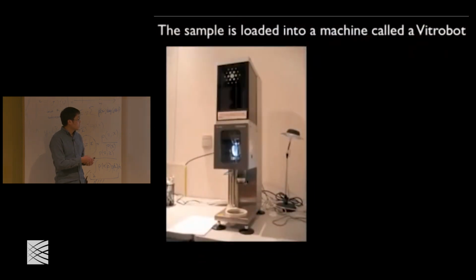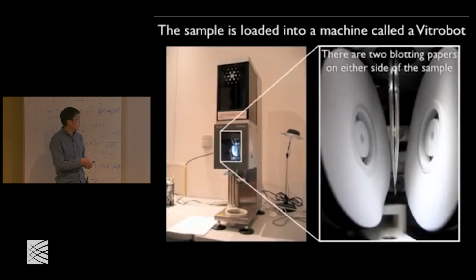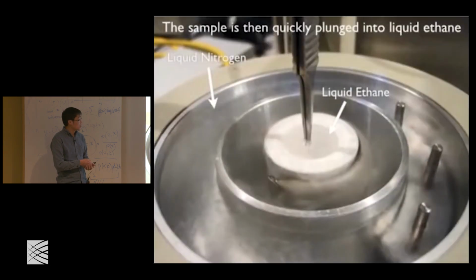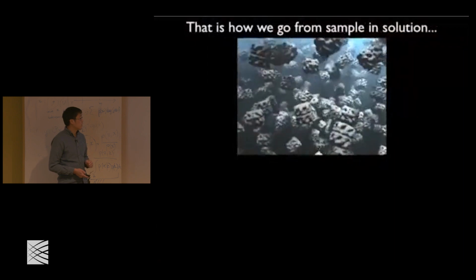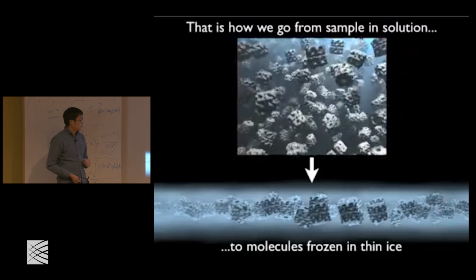And we have a semi-automatic blotting machine. In this chamber, it can control the humidity. You have two blotters with filter paper on them. Then you basically slam the two pieces of filter paper onto your grids, and that absorbs away most of the liquid, and then the grids plunge-freeze into liquid ethane. The freezing is very fast, so crystals cannot form. You only get vitreous ice, as a thin layer.